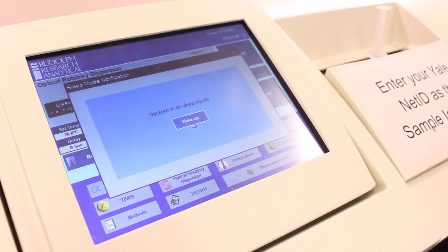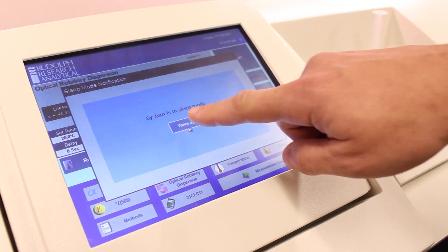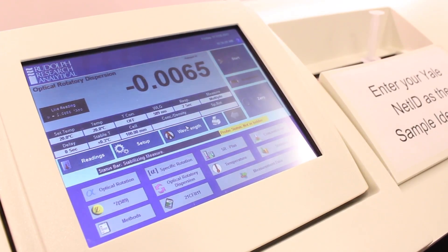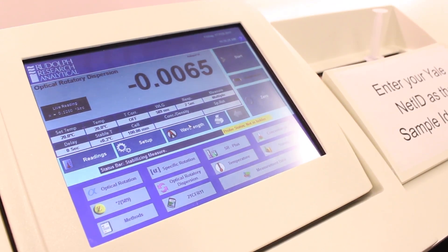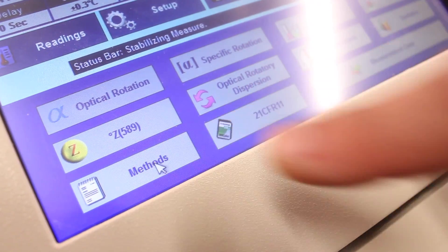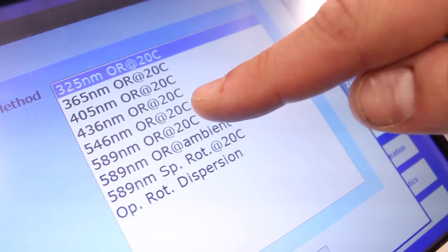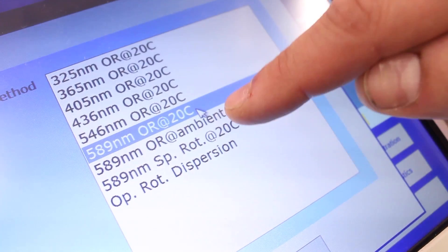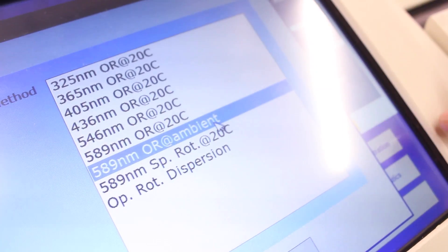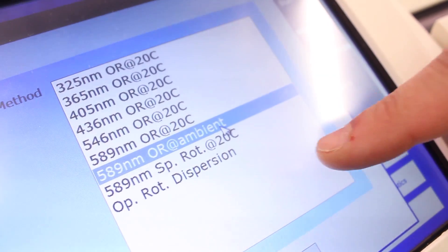The polarimeter should already be powered on and running when you come to use it. If the instrument is in sleep mode, press the button to wake it up. The best way to run the polarimeter is to use one of the predefined methods, which you can access by pressing the methods button. Most commonly, you will want to use either the temperature-controlled optical rotation measurement at 589 nanometers, or the ambient temperature measurement at 589 nanometers, depending on what kind of polarimeter cell you're using.